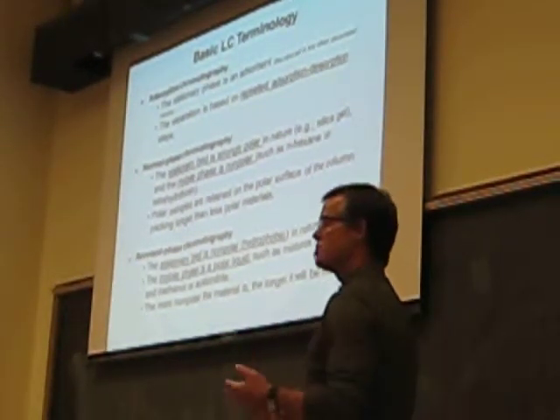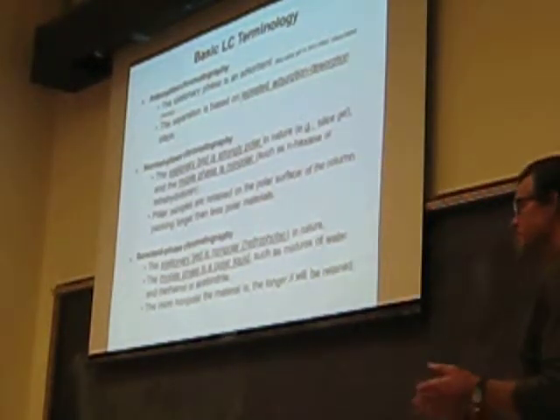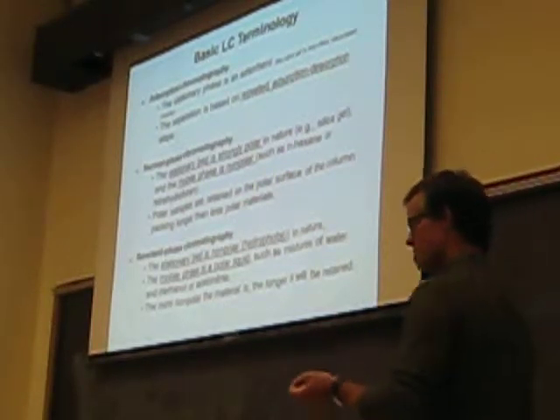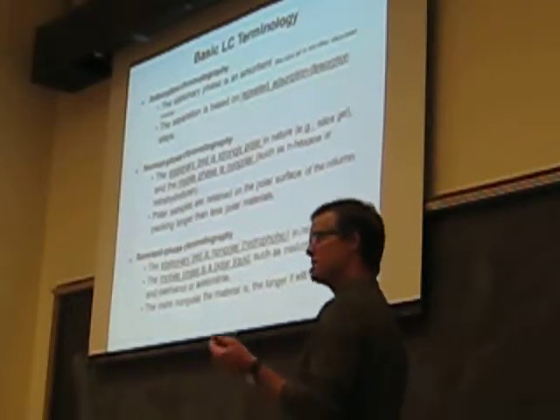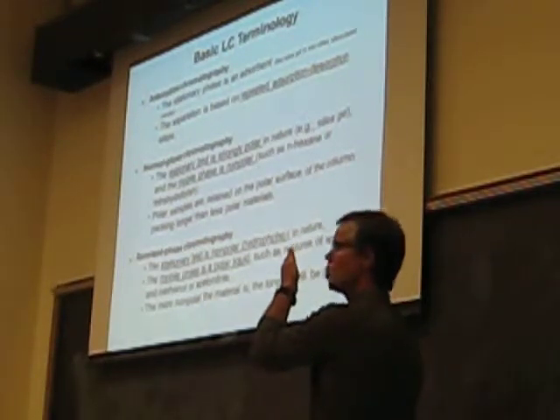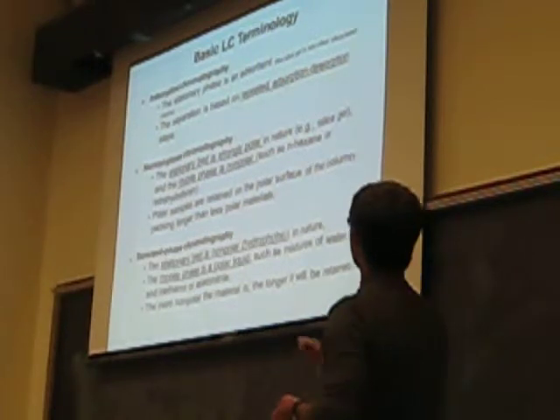And so the first step is trying to get a sense of what is it I'm trying to separate and analyze, and what are the chemical properties of those compounds that I'm trying to separate and analyze. And then based on what I know about their chemical properties, I can then start selecting what might be the most appropriate chromatographic approach.